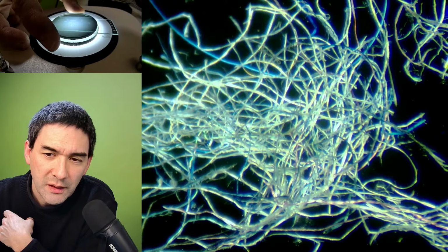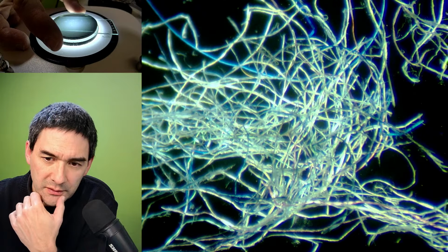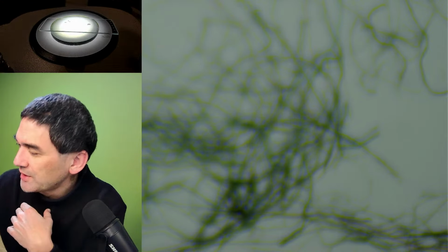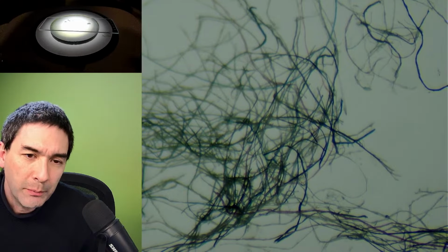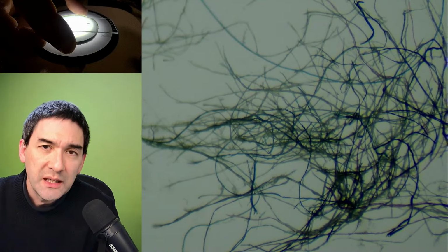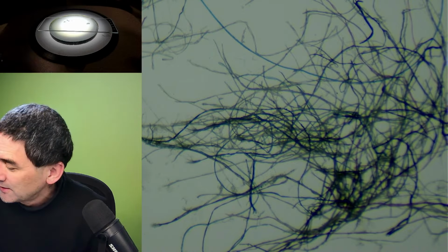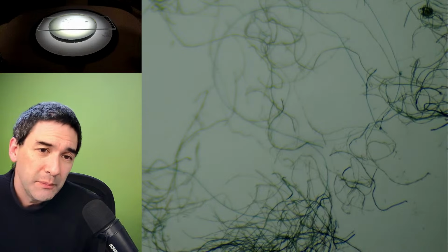At the same time I'm reading the comments here. There was a question, why are some fibers colored? Indeed, some of them are colored blue and so on because they're from clothing. House dust does contain a lot of fibers from clothing and also skin cells. Skin cells are very, very common. Now I'm going to zoom out a little bit so that we can see this better.